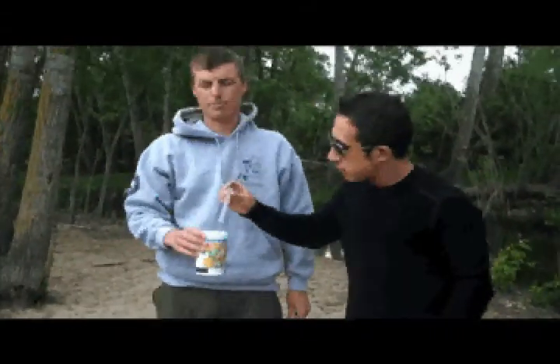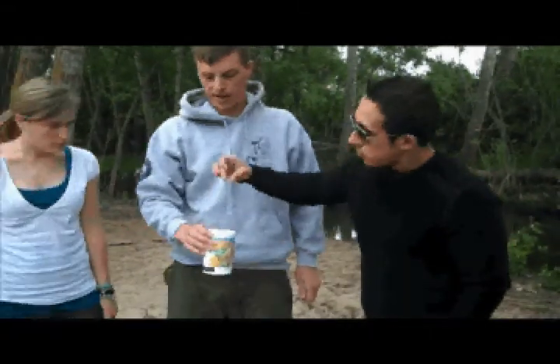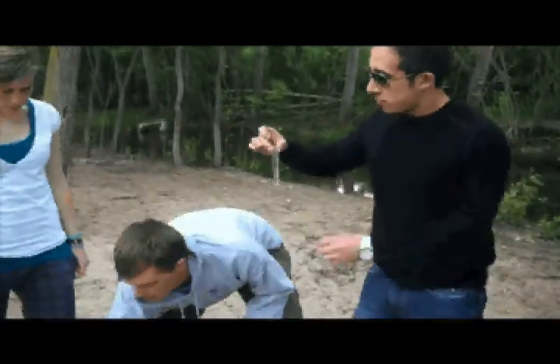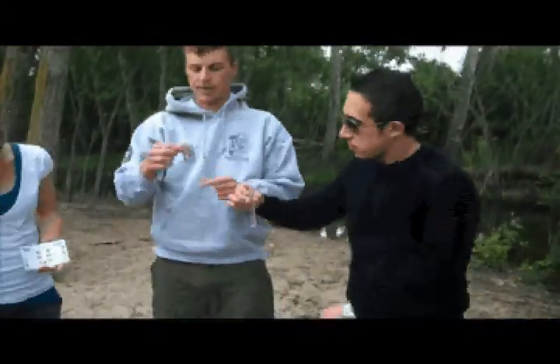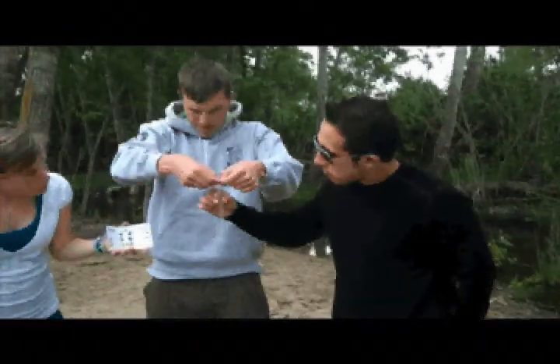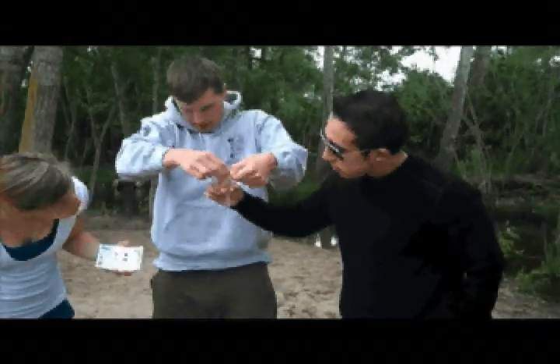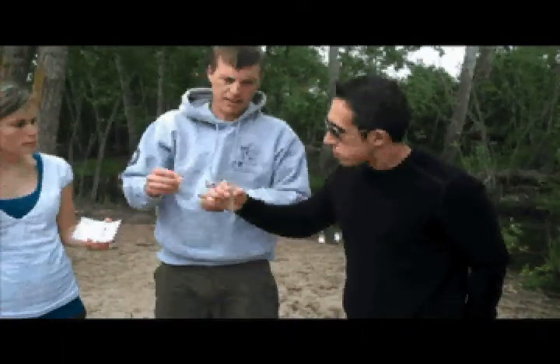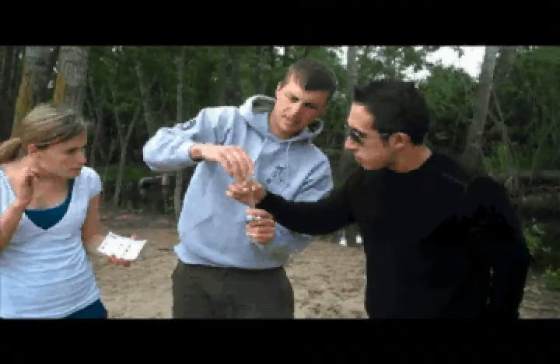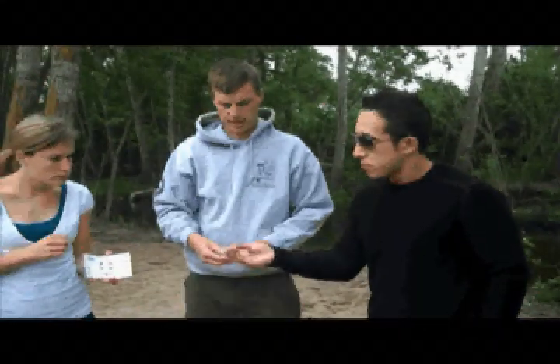Okay, our next test is pH. So our assistant here will plunge the sample vial in there, making sure there's no air in it. We have a packet of tabs. This one has one left in it. So we'll pop it into the dish. And then you'll cap it so that any excess water is forced over the sides. There we go. And then you just want to invert that nice and slow until it starts to dissolve.